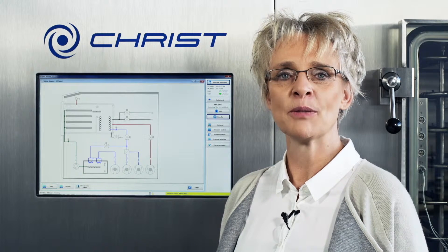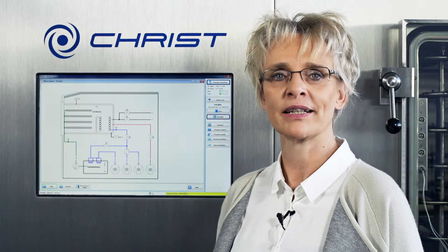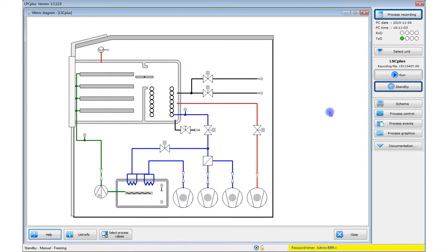Here, you see a schematic picture of the freeze dryer. It gives you an overview of the status of various parts. For example, running pumps and open valves are color coded.